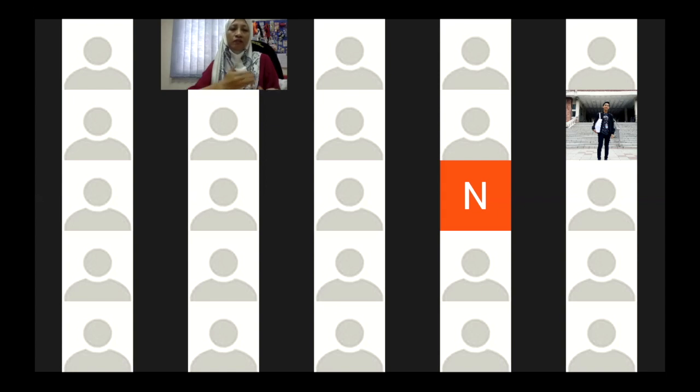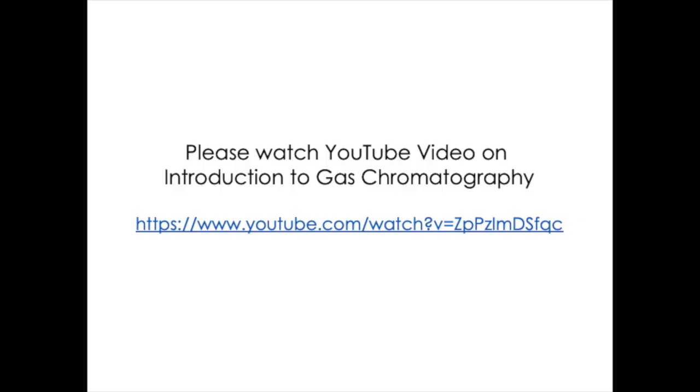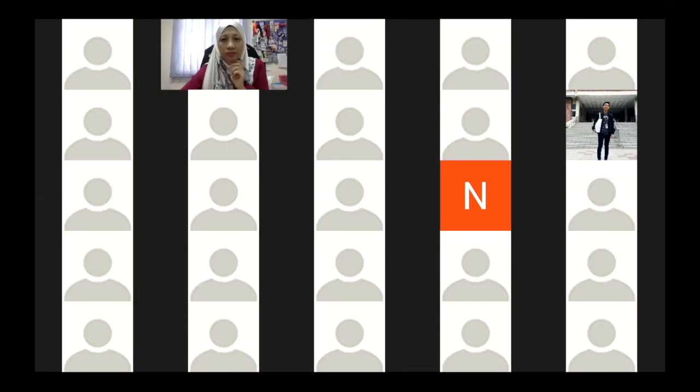The first one is very simple, just to recap what I have explained, how the chromatography injection looks like, and the second video is a bit more detailed about GC. I'm going to share the second video.